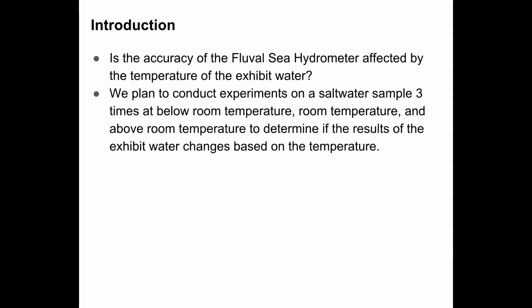Now, the question that we chose was, is the accuracy of the Fluval Sea hydrometer affected by the temperature of the exhibit water? We wanted to conduct 3 experiments on the exhibit water, and the exhibit water that we're using is salt water, from the otter exhibit at the Fresno Chaffee Zoo. We wanted to conduct 3 experiments, one at room temperature, one below room temperature, and one above room temperature to determine if the result of the exhibit water changes based on the temperature.